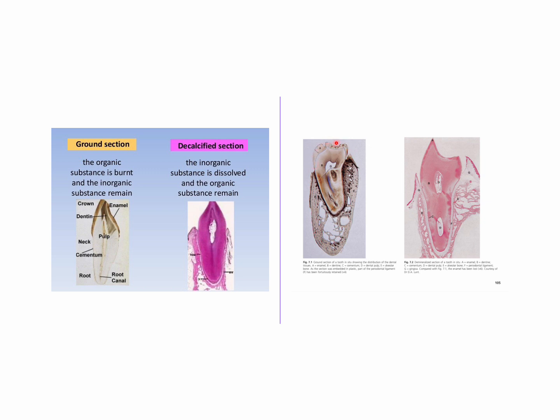You can see that enamel is really thin compared to the dentine below. It is thinnest on the cervical margin here, and the thickest under the cusps and on the occlusal surface. In this demineralized section, we can see only the enamel space.